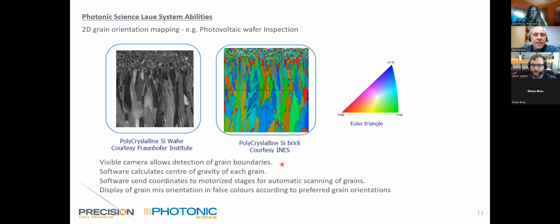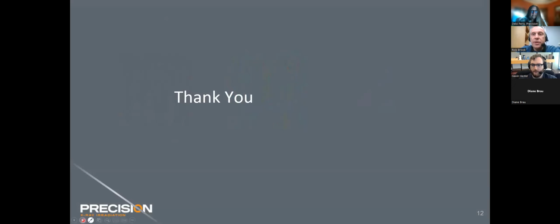The visible camera allows detection of grain boundaries. Okay, so that's it. Thank you very much for listening.